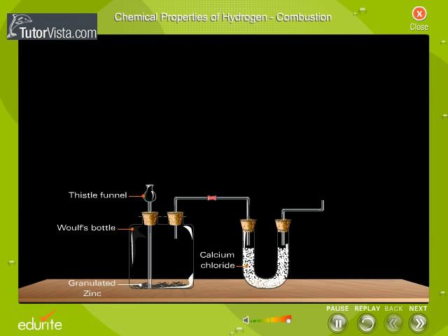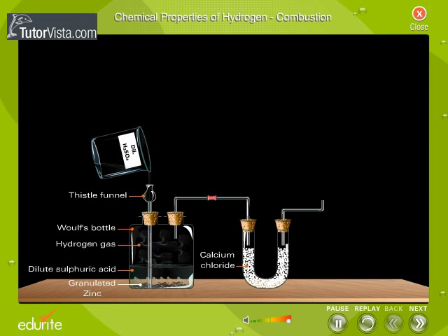Zinc granules are taken in a Woulff's bottle and the apparatus is arranged as shown here. Dilute sulphuric acid is dropped into the Woulff's bottle through the thistle funnel.